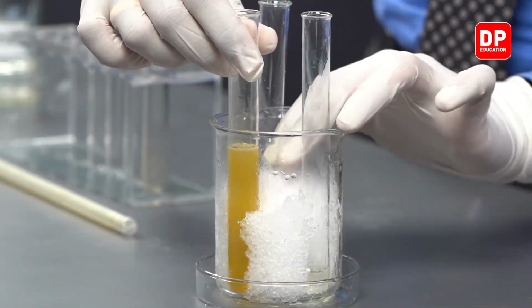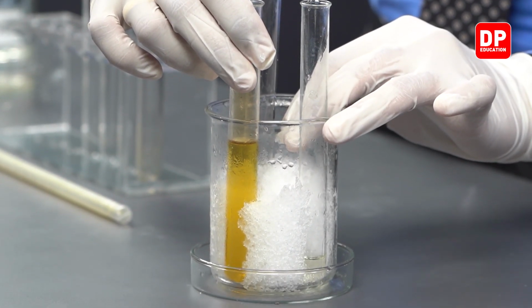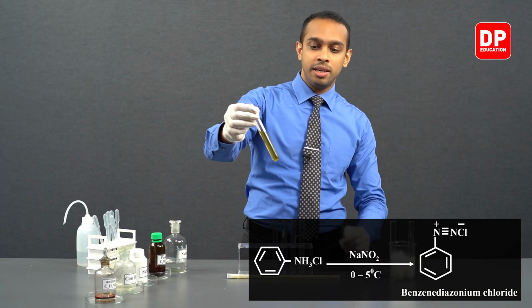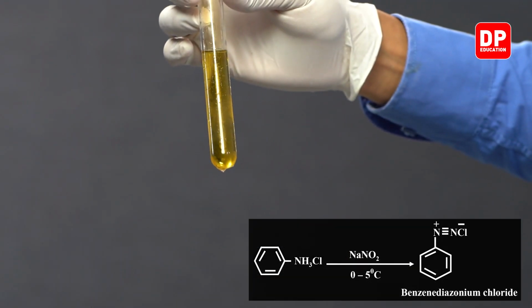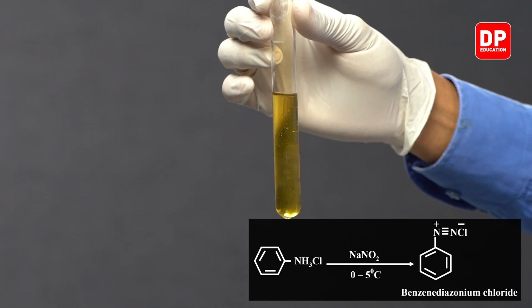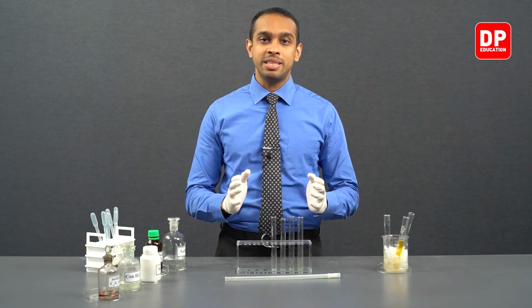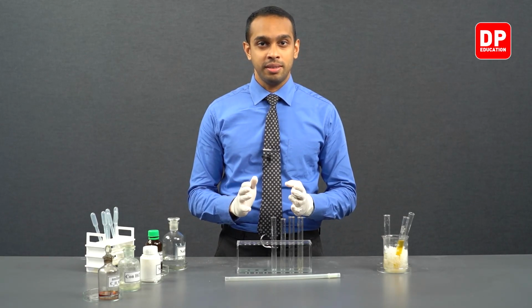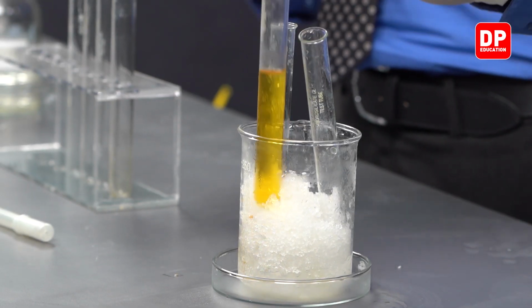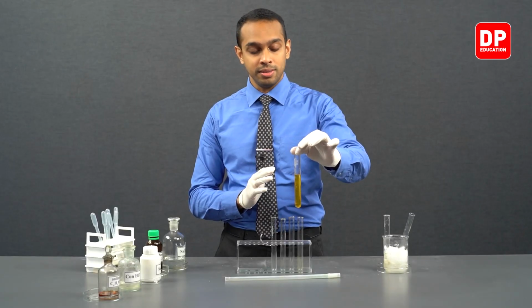And as you can see, we are forming a yellow color solution. This yellow color solution is our benzene diazonium chloride solution. Students, now we have made benzene diazonium chloride. So we have an aromatic benzene diazonium salt, which is benzene diazonium chloride that is formed here. And you can see it is yellow in color.